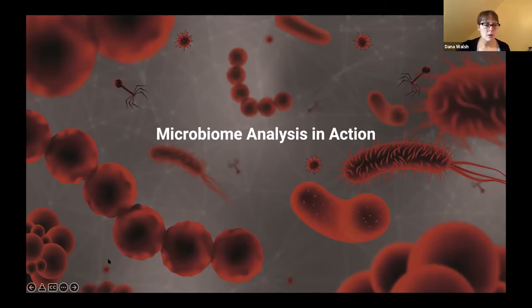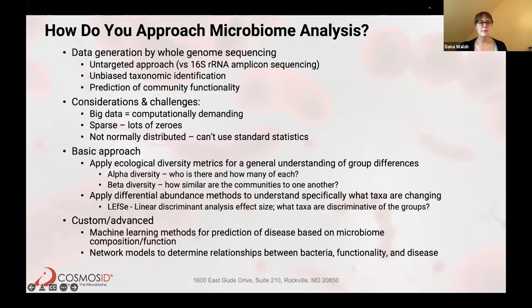Before we jump into it, I wanted to give a little overview about some challenges and considerations we need to take into account with microbiome analysis. It's challenging because it's big data. So there are some different things you have to think about.